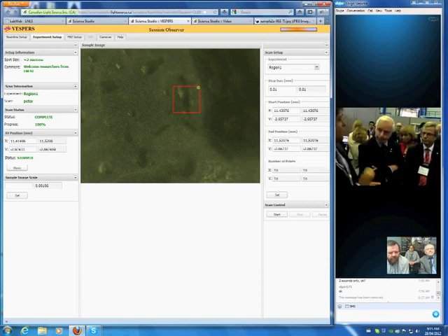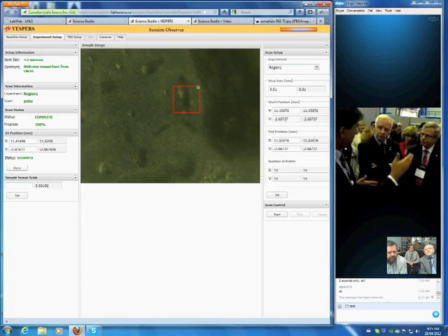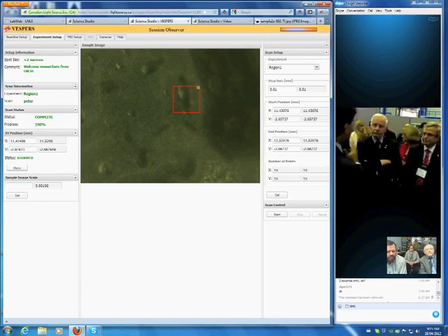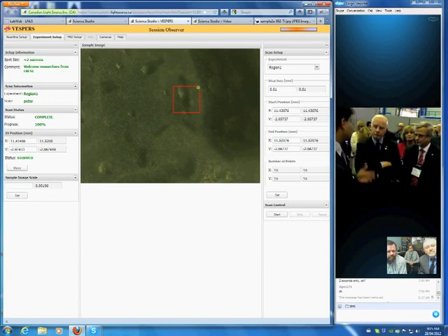Now, it's very important in this kind of experiment that you have a microbeam. This means that you need an accelerator, like the Canadian source, or the Sirius that we're going to build. So a third generation light source, right? You need a very tiny microbeam. The smaller the beam, the more resolution you have in your system. And this kind of collaboration that we're doing here will benefit both sides. The science is also going to happen in work for the oil sector. They're going to use it at the same time. So you're going to learn from it. Great.